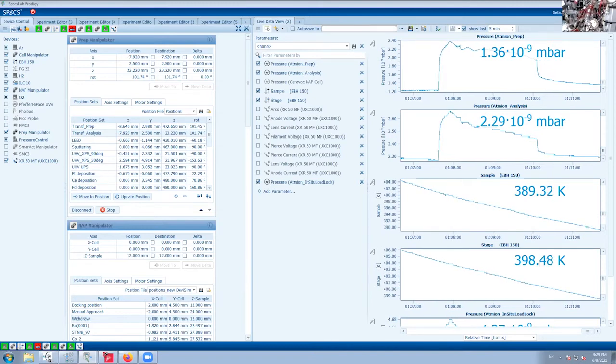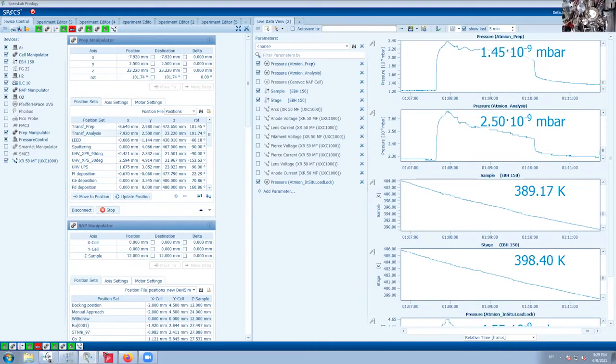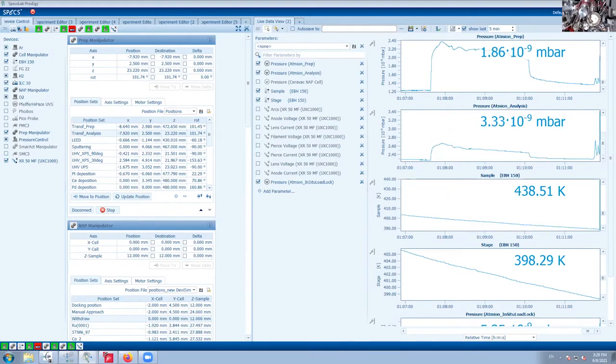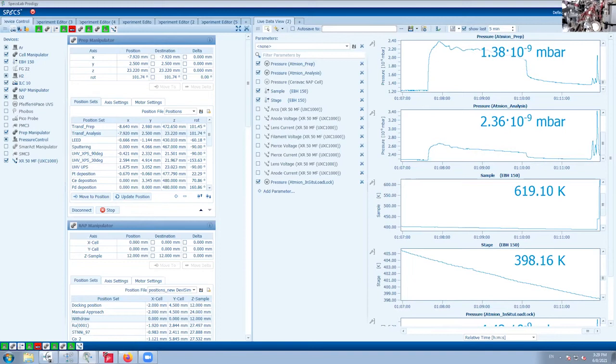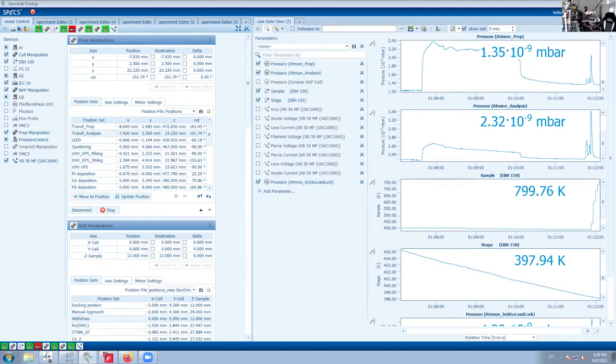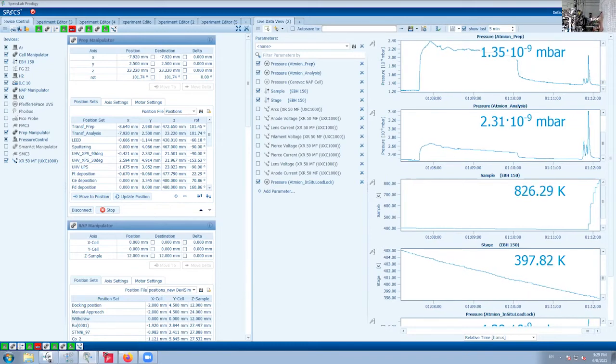So Brett now is going to use this wobble stick, which is, as I said, used for taking the sample. I don't know if it's seen, maybe not much, but you take the sample and you see the sample here. It's not seen very well, but for example, I already took the sample from the UHV manipulator and put it on the wobble stick. On the wobble stick, yeah.